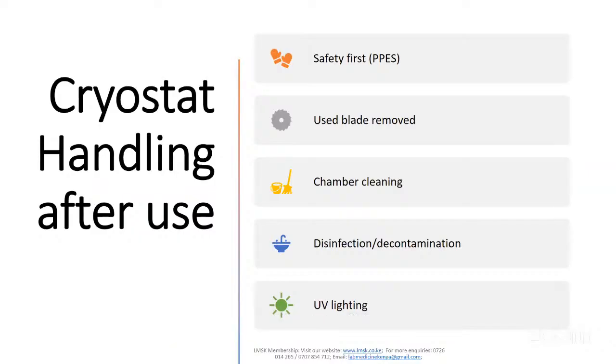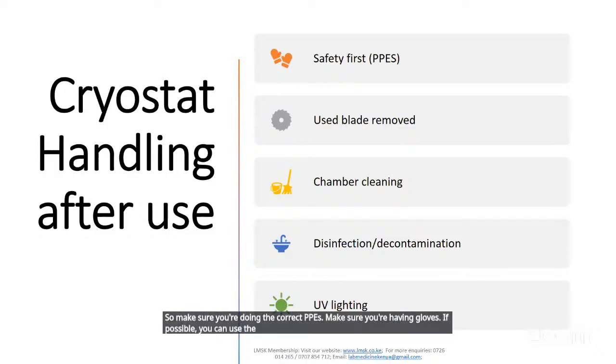How do you handle cryostats after use? As I mentioned earlier, PPE. Kindly don the correct PPE because your safety comes first. You are handling a fresh sample, and this one must be handled with a lot of care. So make sure you don the correct PPEs. Make sure you're wearing gloves. If possible, you can use surgical gloves.